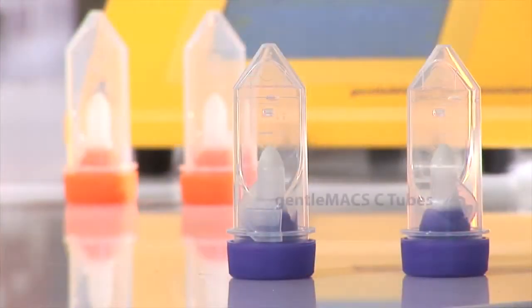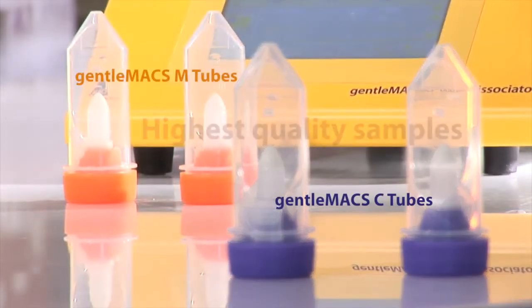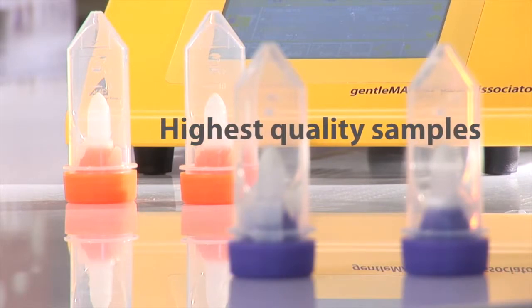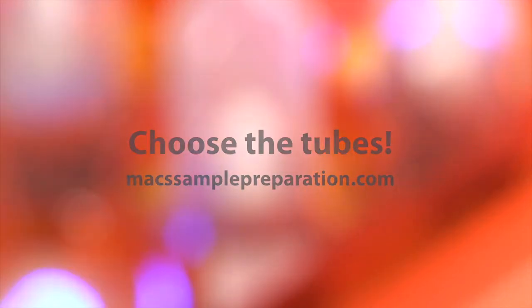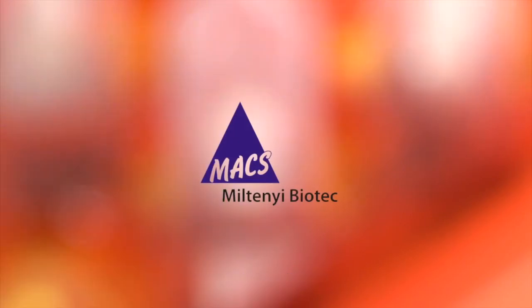GentleMAX C and M-tubes, together with GentleMAX dissociators and GentleMAX kits, ensure that you get the highest quality samples for downstream applications — whether you're a little bit country or a little bit rock and roll. Miltenyi Biotec: choose the tubes.